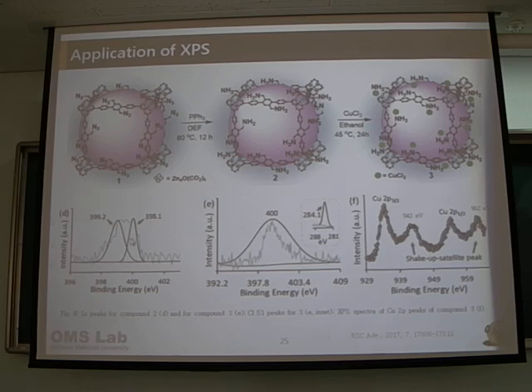In this case, the survey data don't show the copper. I also show another. No. You have a different nitrogen, and after coordination, this nitrogen also will be different. That's what you're trying to say, right? Yeah. But there's no nitrogen peak, first of all. After coordination, you did not show any nitrogen peak. After inserting the copper, this middle one, the nitrogen peak of the. This is after coordination? Yeah. Oh, not this one? The middle one. Not this nitrogen, this is after coordination?